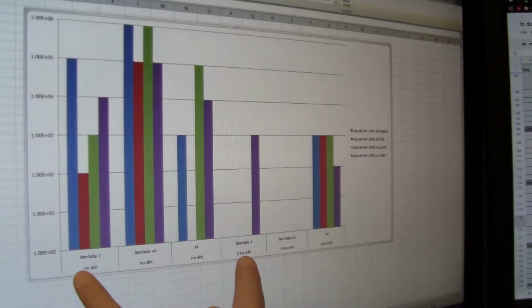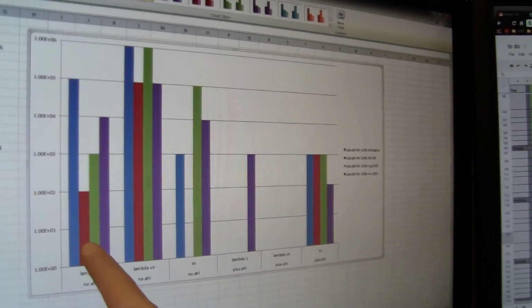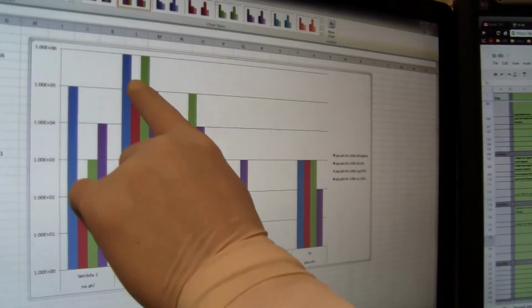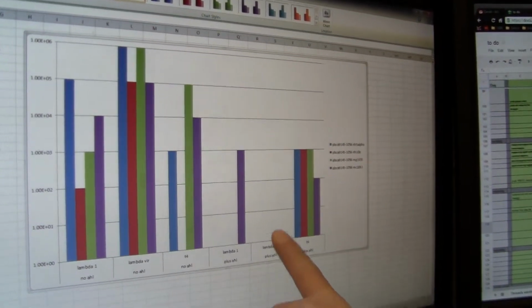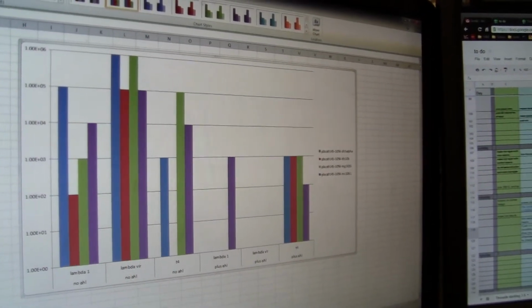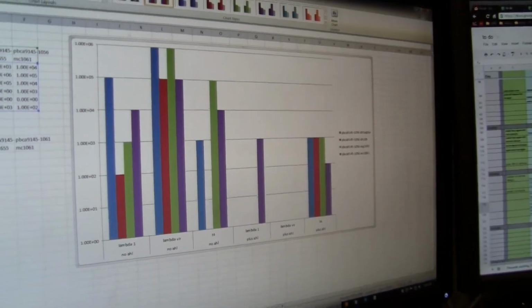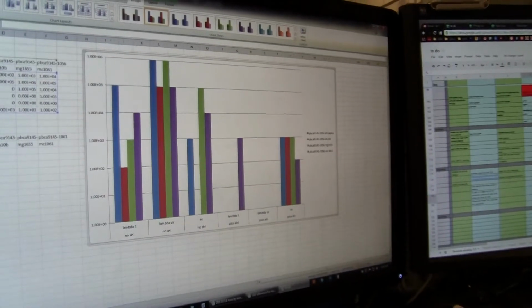But for right now, you can see that you can compare your lambda 1s plus or minus AHL and all these different strains. And you can see you get really good protection on these three, but not so much with MC1061. Lambda vir looks especially good. You can see you get up to 10 to the 5th, 10 to the 6th clearing versus 0 over here. A lot of protection. So we are really interested in using this moving forward. And the T4 didn't work so well. So that's kind of how you would go from these spots to data. And I would do that entire whole process again with the T4 set. I'm not going to do it right now, but hopefully you get the idea.